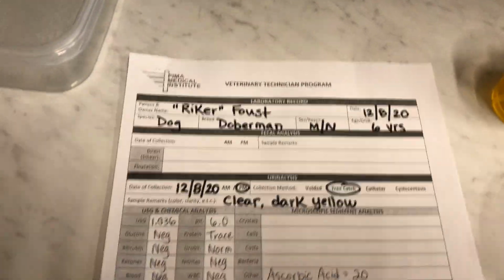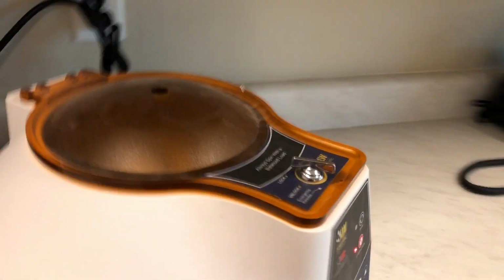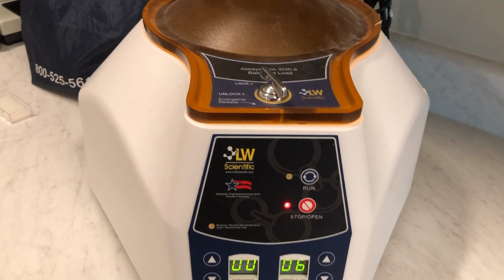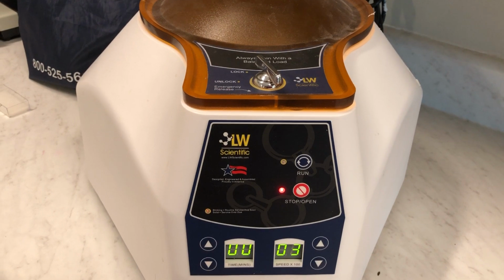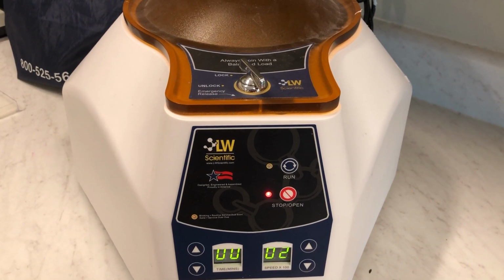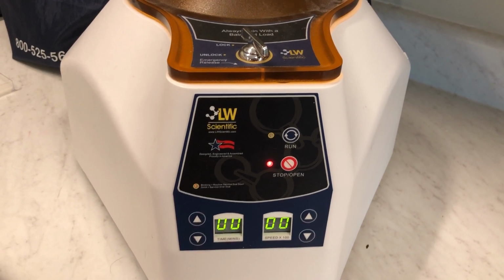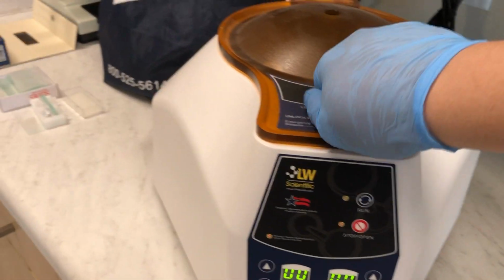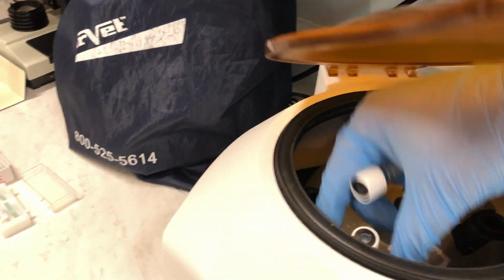Okay, so perfect timing because the centrifuge just finished spinning. Gotta wait for it to slow down. Okay, so that means it's safe to unlock and open. And then I want to remove my balance and my sample tube.